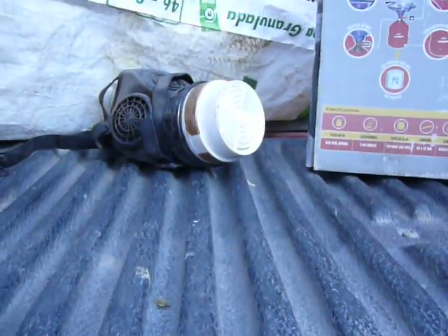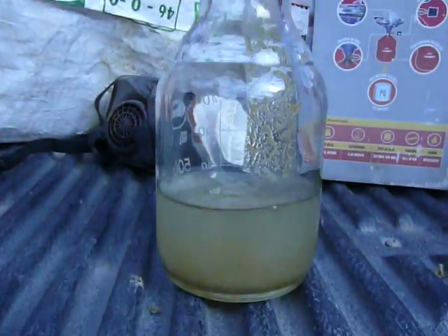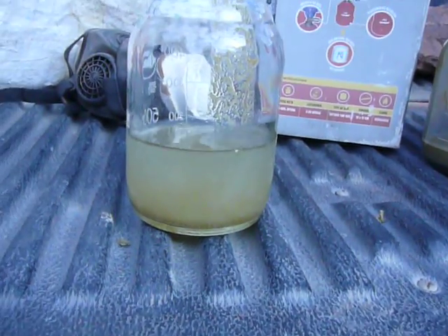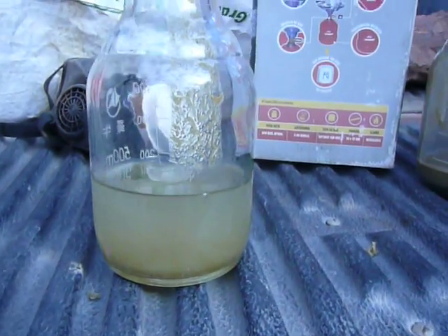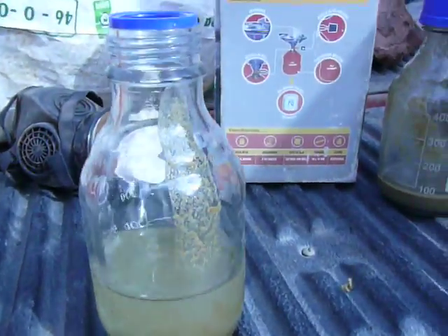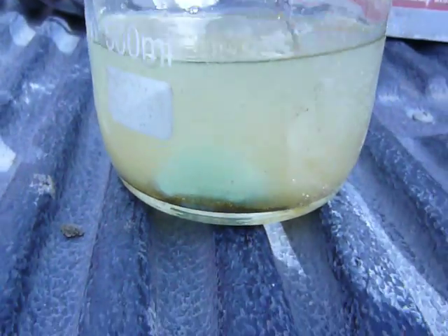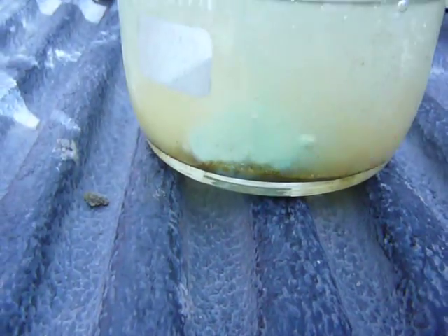Pedro is gonna drop a 50 peso metal coin made out of copper, just to show you that this will dissolve. It's dissolving pretty quickly.